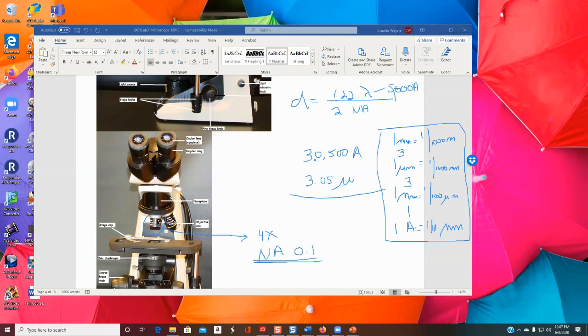Normally, you would look at the microscope lens to find it. And unfortunately, well, I can't magnify. This picture isn't clear enough. And so I can't do that. Maybe we'll find a picture as we go along in the rest of the lab exercise. So remind me before it's all over. I will definitely give you that number. If I can't find it, the easiest way is the internet, and just say numerical aperture for 40x objective lens. If someone wants to do that while we're doing other things, that would be great, because we could give the answer to everybody.